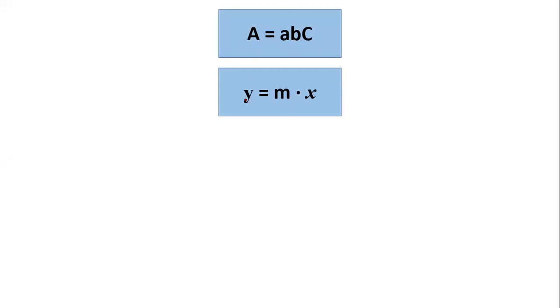So obviously, if I plot absorbance on the y-axis and concentration on the x-axis, that's what you were trying to say, correct? Yes, sir. Then path length is not going to change. You don't change the diameter of the cuvette while measuring, do you? No, sir. So path length is going to remain constant, correct? So whatever you get, the slope of the line will correspond to the absorption coefficient, right? Yes, sir.